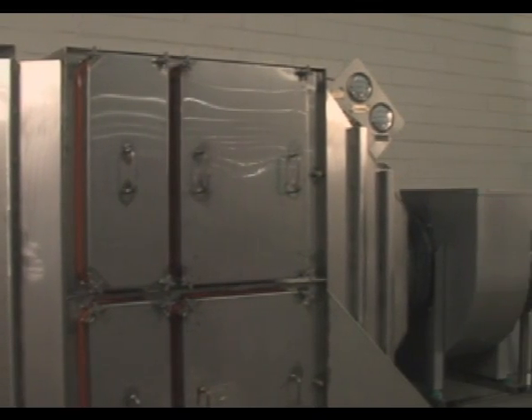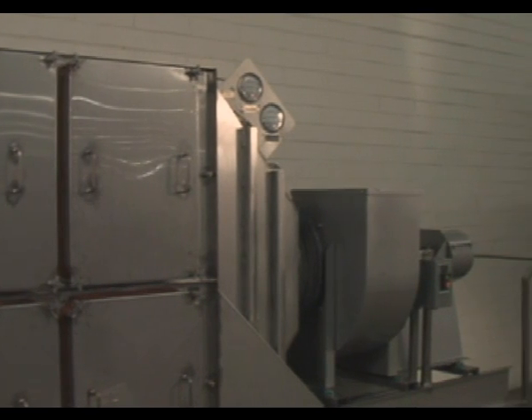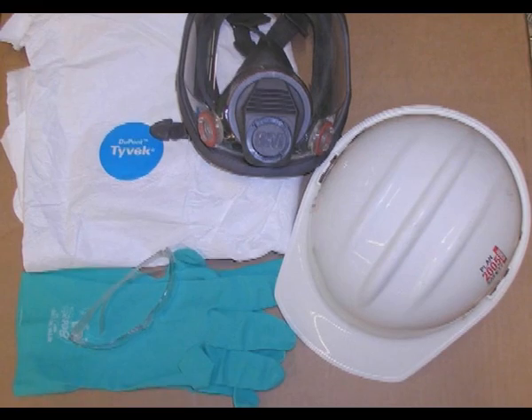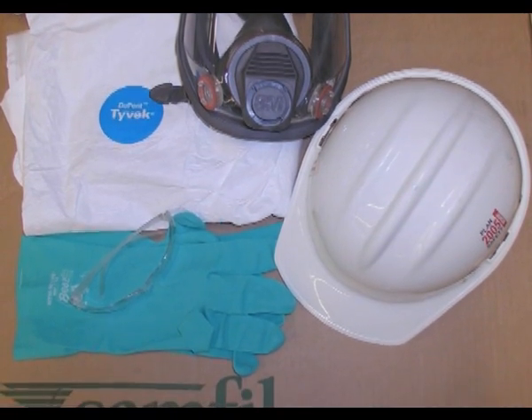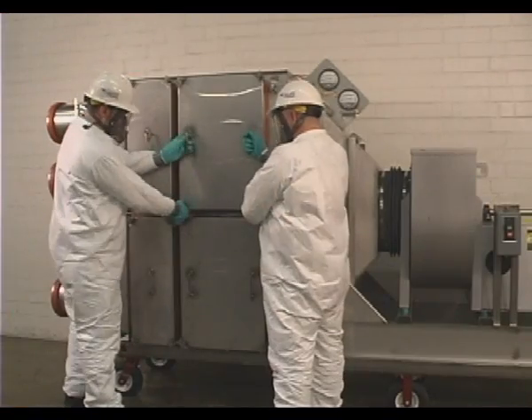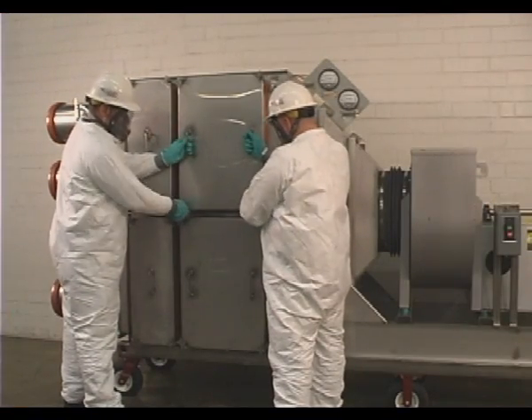To perform the filter replacement on the Camfil Far Bag-In, Bag-Out filter housings, maintenance workers should be clothed in Tyvek coveralls, hardhat, safety glasses, gloves, and gas masks if applicable. Use these guidelines along with any amendments or procedures of your company's safety policies.